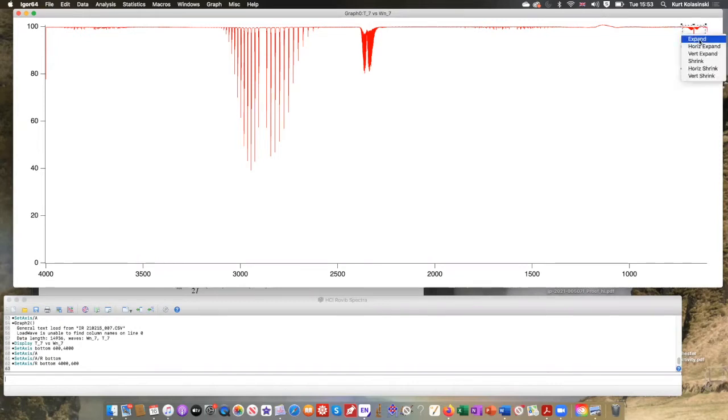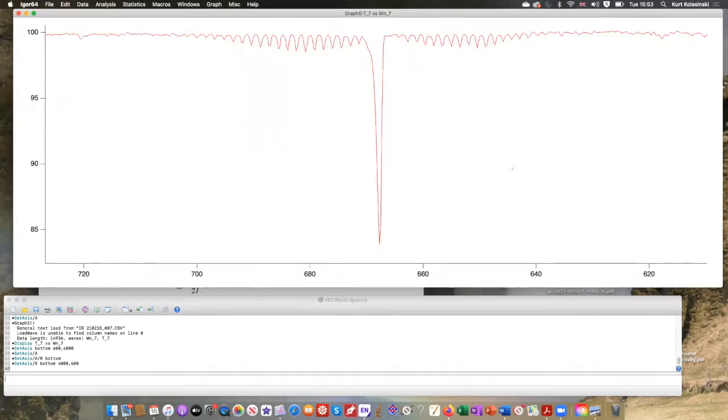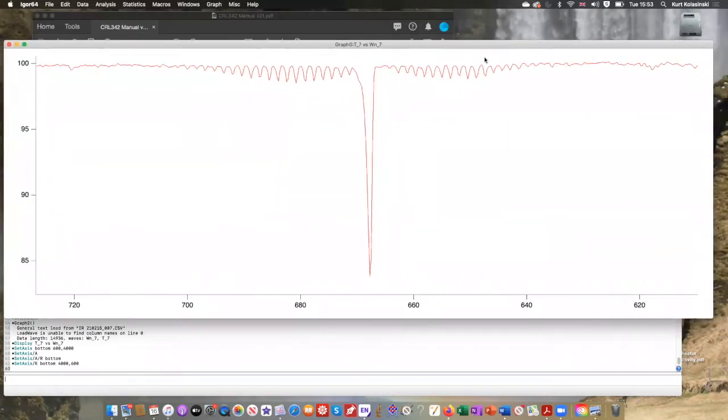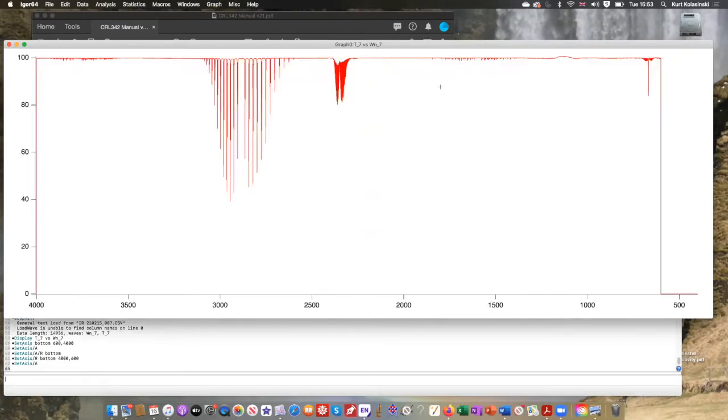So we've got one way down here at low wave number. Let's expand that out. Bunch of peaks here. Move that down just a little bit there. Bunch of peaks here, and then some sharp thing, and then a bunch of peaks. I'm going to call this a branch of peaks over here, and a branch there, and a branch there. Interesting. Are they all like that?